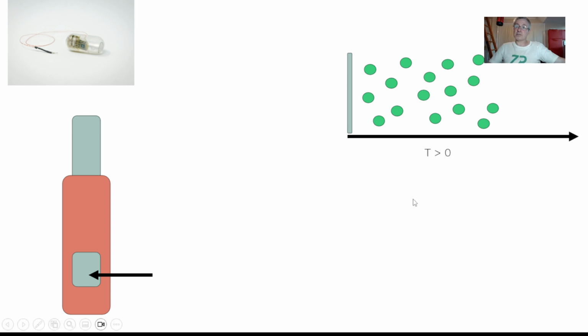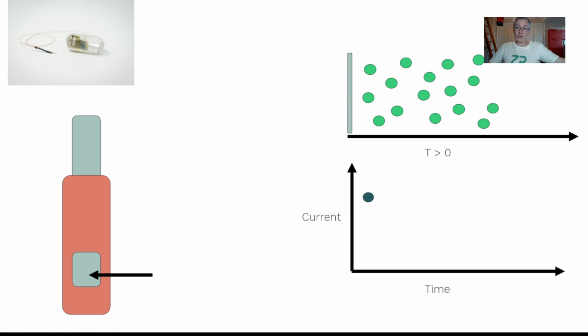Now after t equals 0, you've turned on the voltage, and what will happen is you'll get some current. But in a non-microelectrode scenario, and I would say that anything with a length scale of millimeters is really not a microelectrode, then as time increases, the current decreases.